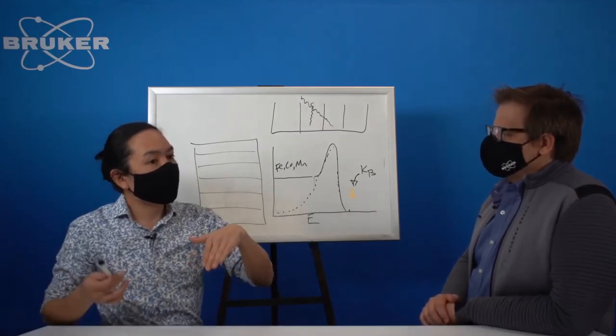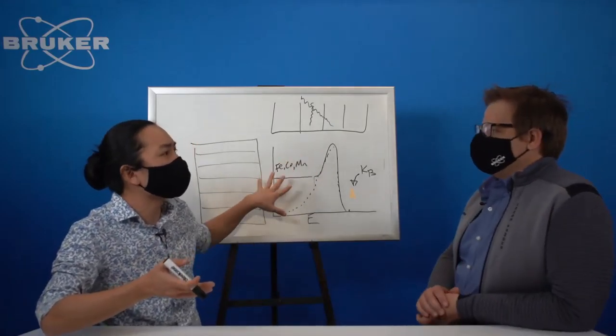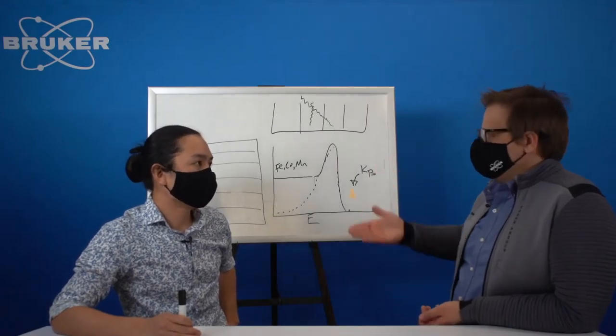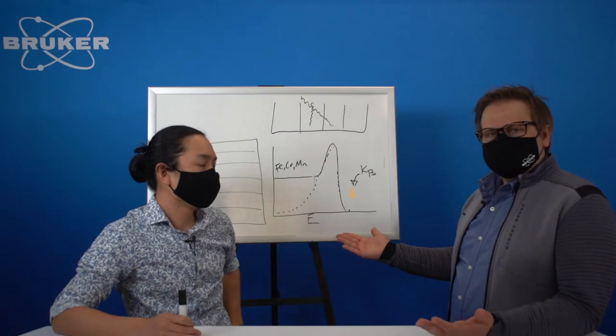It's the X-ray off your tube exciting your sample and your sample basically glowing with X-rays. And so those glowing X-rays tend to give you a lot of extra background. We'll show it a little bit when we get down to the lab. Here, there are no more analog nickel filters or beta filters. That gives you a boost of signal. So high signal, eliminating that gives us low background. And in the end, then we have much better signal.